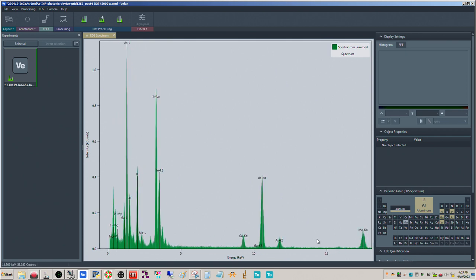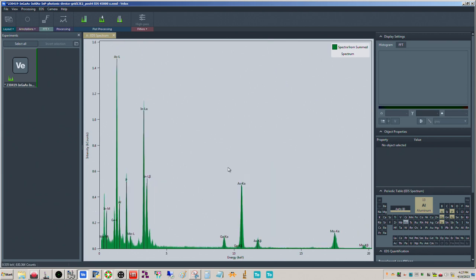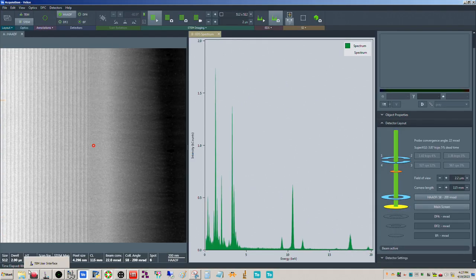And so you're seeing the molybdenum signal. But the peaks are actually fairly well separated here, so these are going to work pretty well for doing what we want to do. Okay, so again, this is just a survey, just kind of telling us what's in here. And okay, so let's see here. Should be almost done. We have very low dead time. And is it done? Yeah, so it's done now.